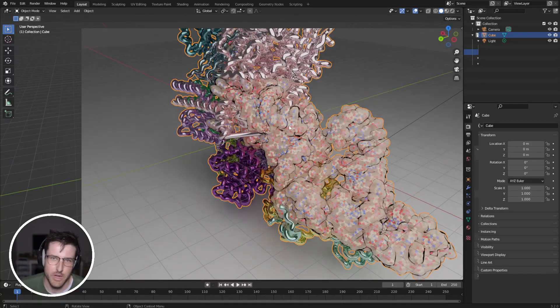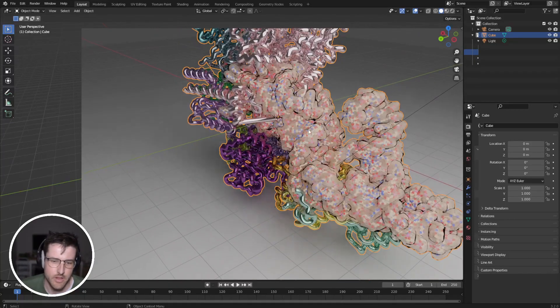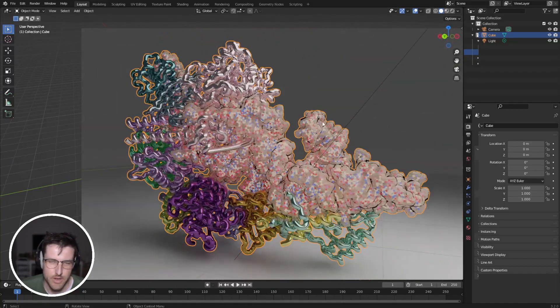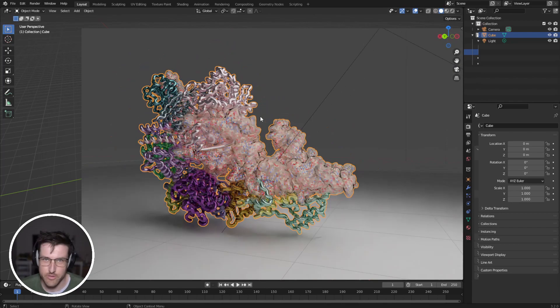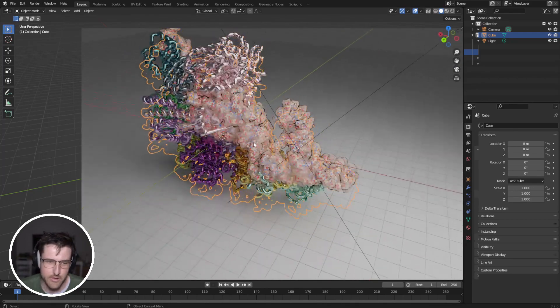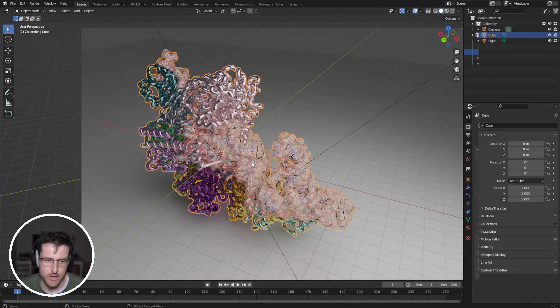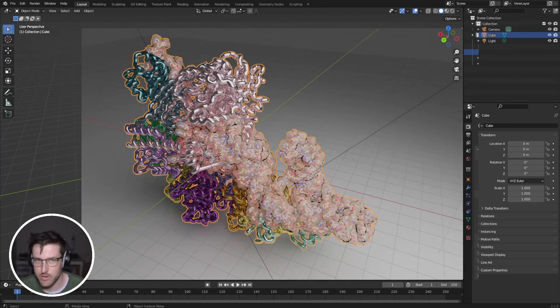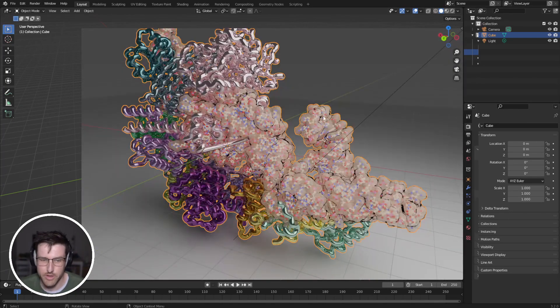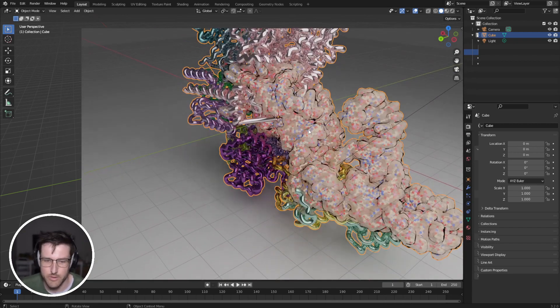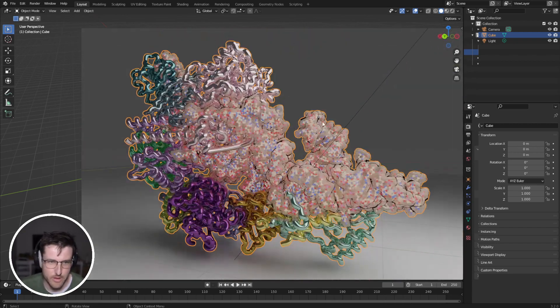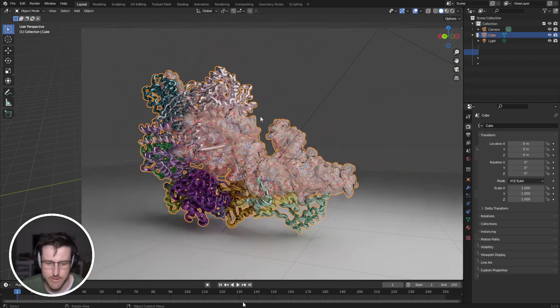Welcome back to Blender for Biochemists. Today I'm going to be showing you how to use materials to apply different materials and different looks to different parts of the protein, but still have it all combined into one cool-looking structure.